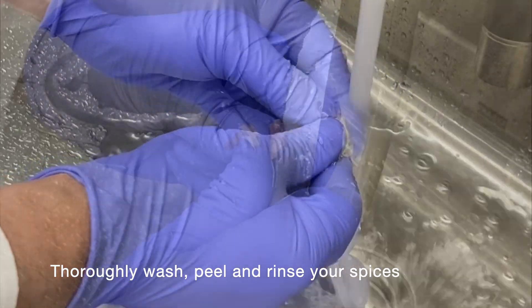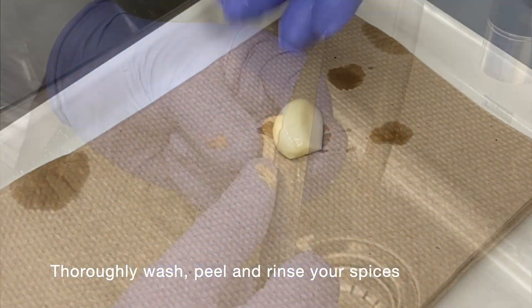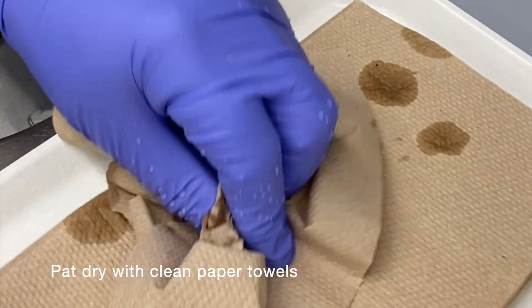Thoroughly wash, peel, and rinse your spices. Pat dry with clean paper towels.